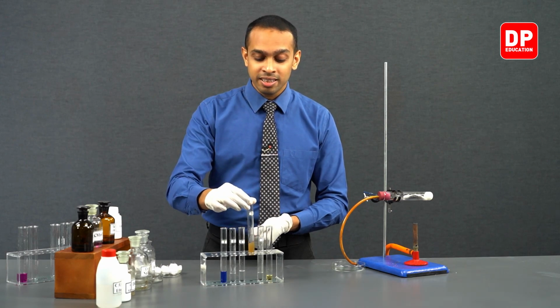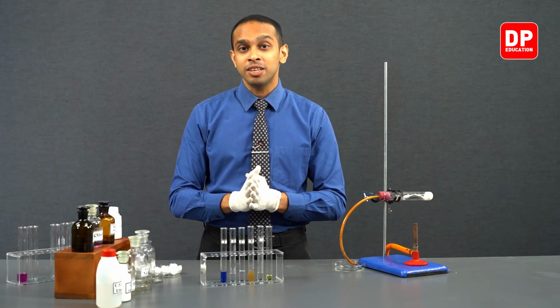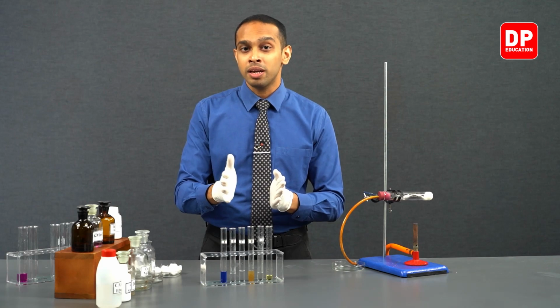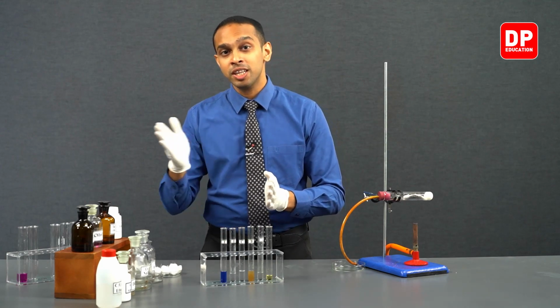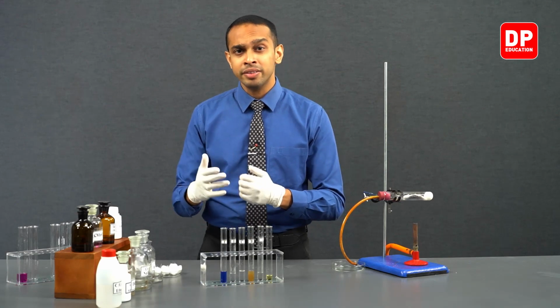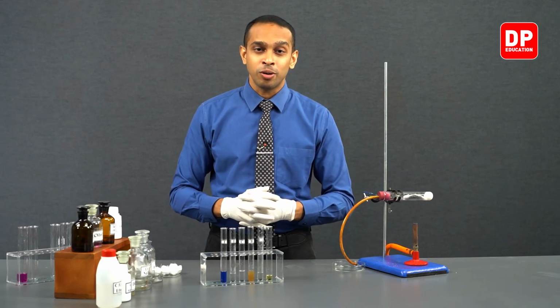So ethene gas reacts with alkaline potassium permanganate and converts the purple alkaline potassium permanganate first to a green color, forming manganate ions, and then manganate ions further get reduced to form manganese dioxide. And while this is happening, ethene gas got oxidized, forming diols, also known as glycols.